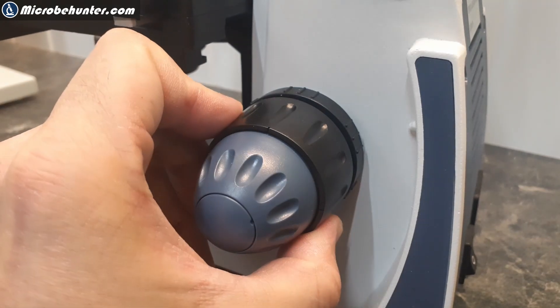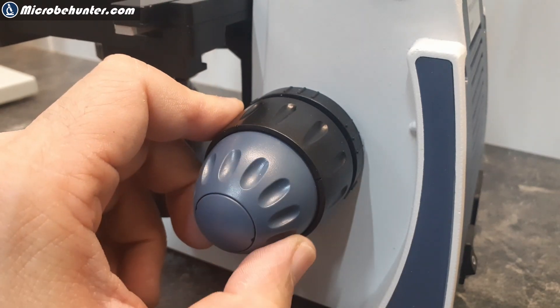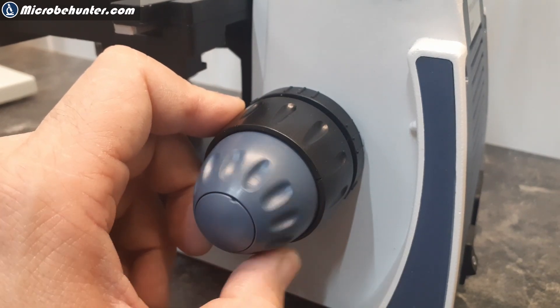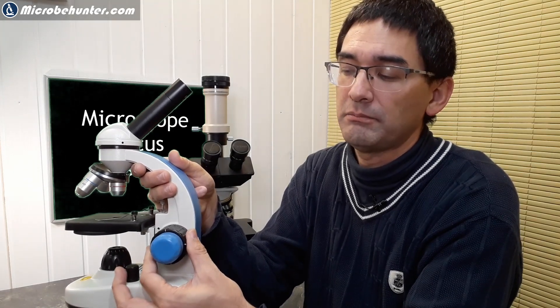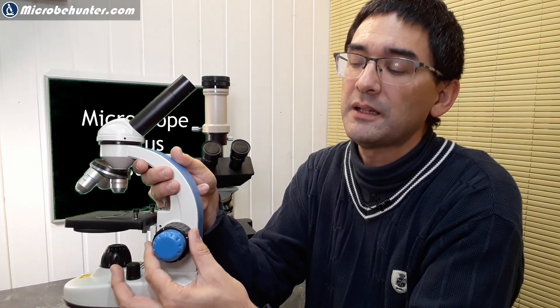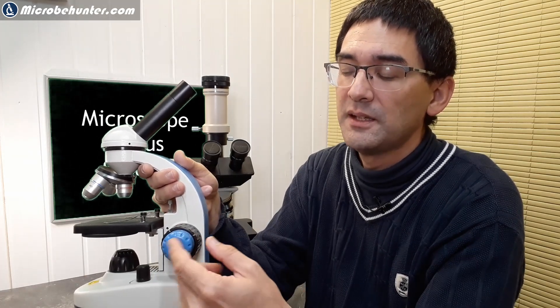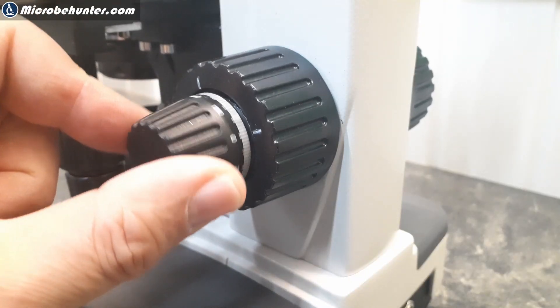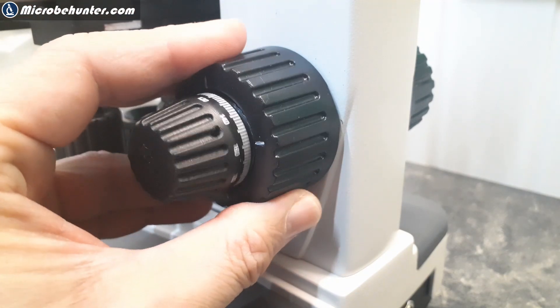When the systems are decoupled, rotating the coarse focus knob does not spin the fine focus knob — it simply moves along with the coarse focus but the gearing is done differently. Which system has advantages or disadvantages? I personally feel that when it's coupled, operating the fine focus knob sometimes doesn't turn quite as lightly or easily. But honestly, for all practical purposes it doesn't make a huge difference, though decoupled does feel a little more precise.